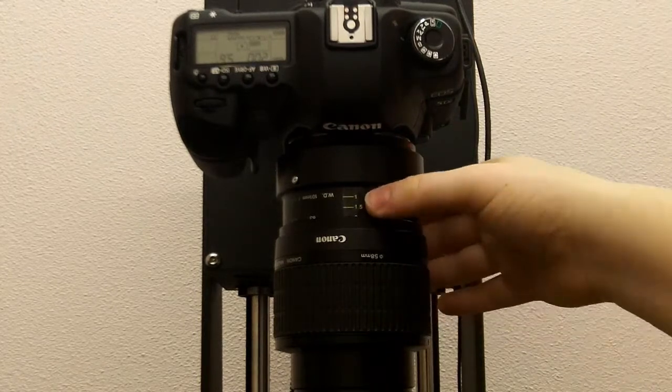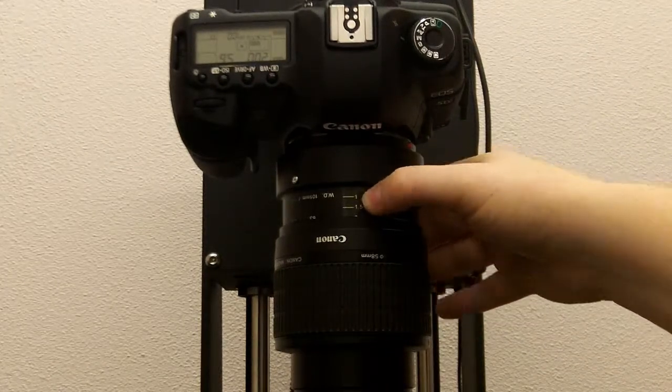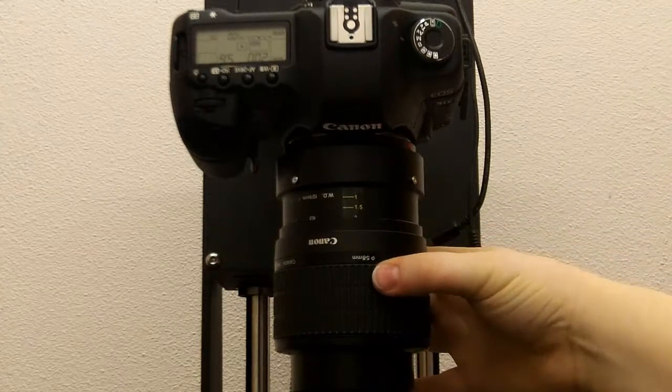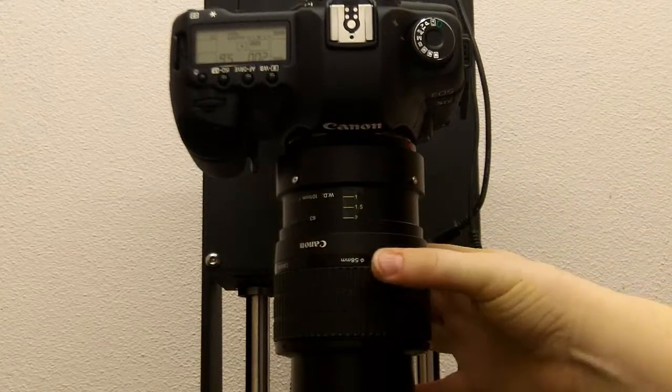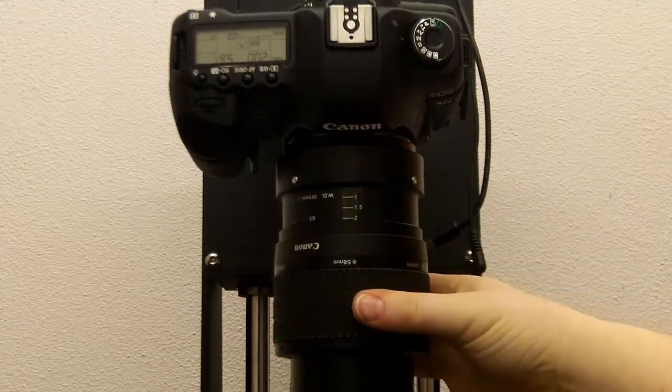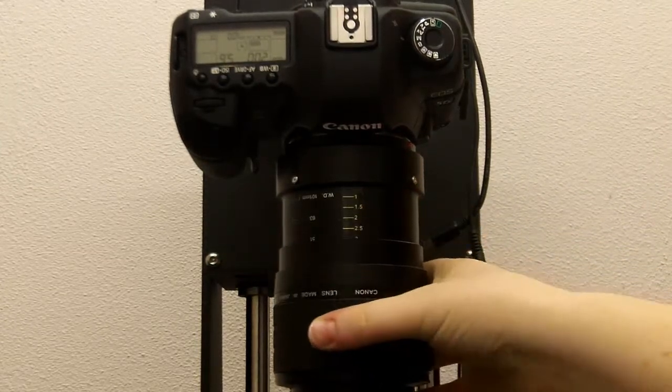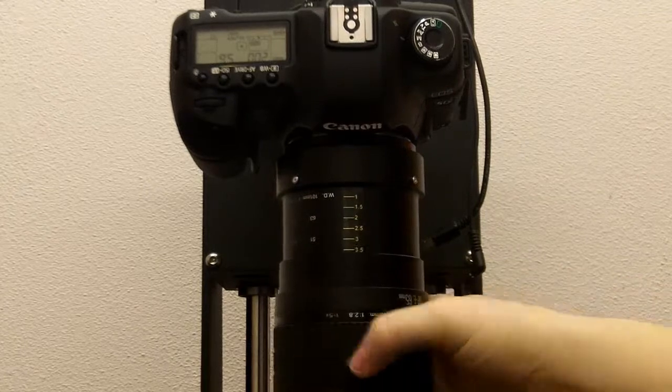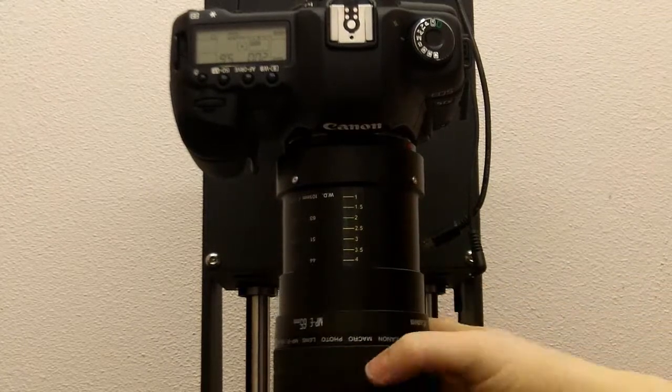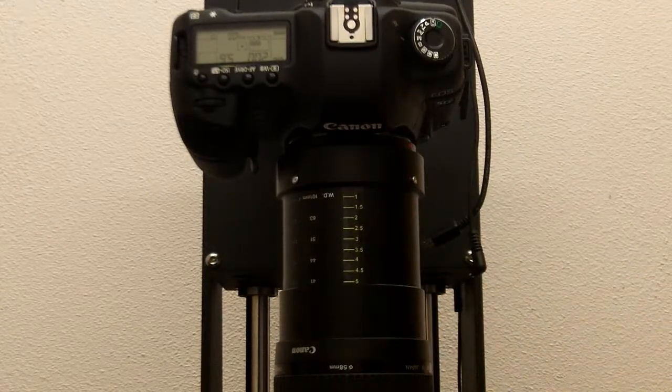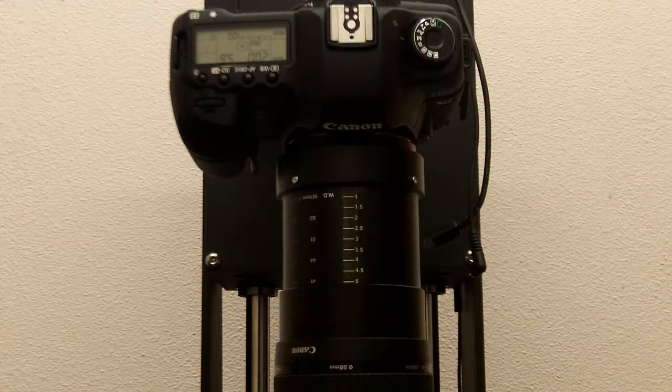So here, the lowest magnification is 1x, and then as I turn the dial, it increases the magnification, 2x, all the way to 5x, which is the highest magnification.